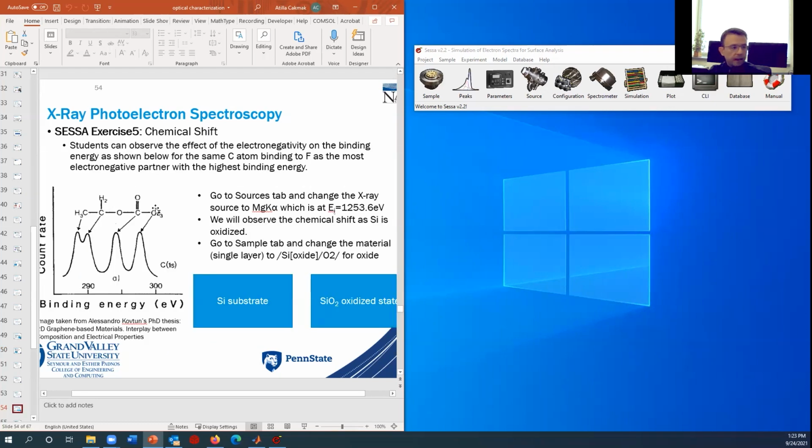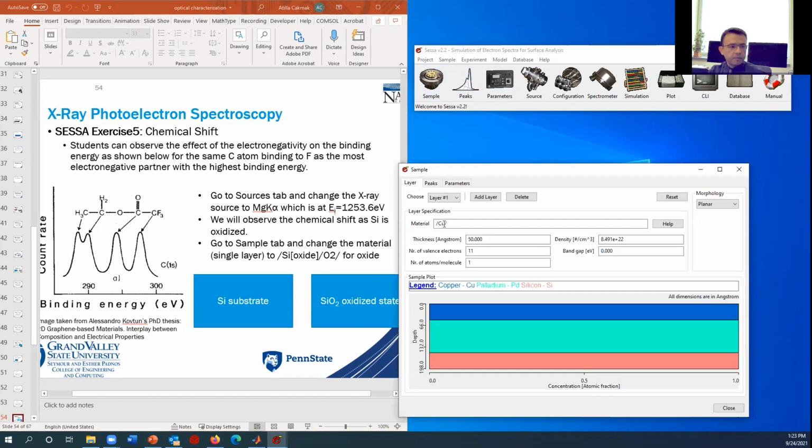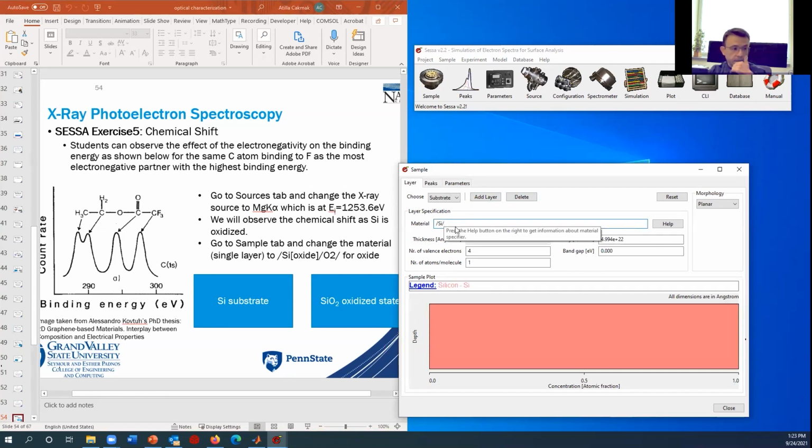All right, what other things can I do? I can look at the chemical shift, which will give me information about the chemical compositions, like in polymer analysis, etc. So instead of just silicon, for example, I can delete these layers. I know the peaks of the silicon, but instead of silicon, there's a certain syntax for this. I can say that this is my oxide right now, and I can determine it to be a stoichiometry of 1 to 2, of course, and I hope it will like it. Okay, yeah, it did. Now it divided it between silicon and oxide, as you can see.